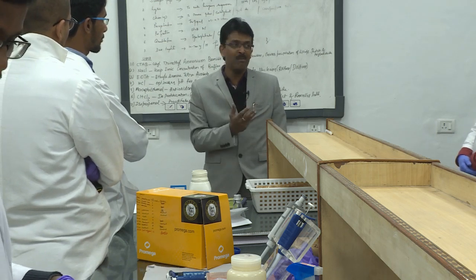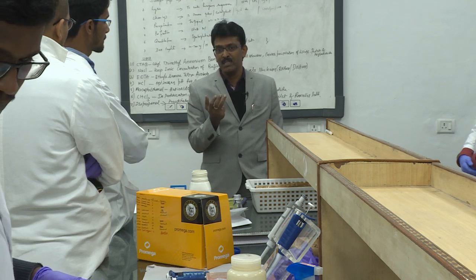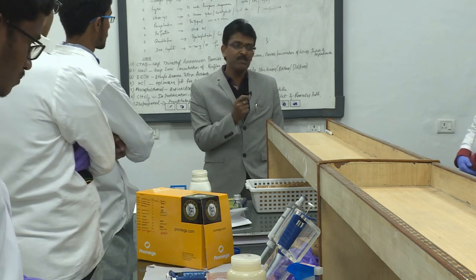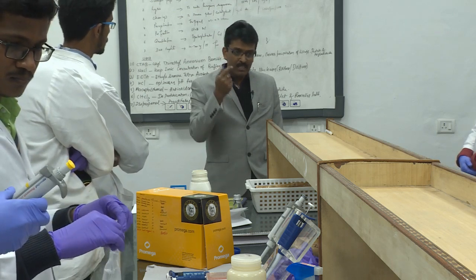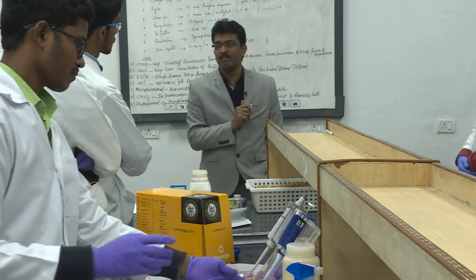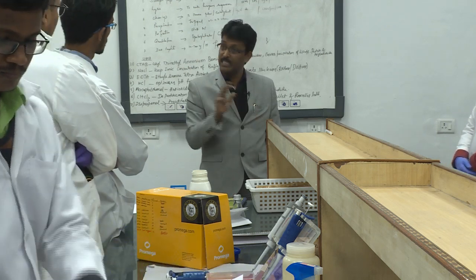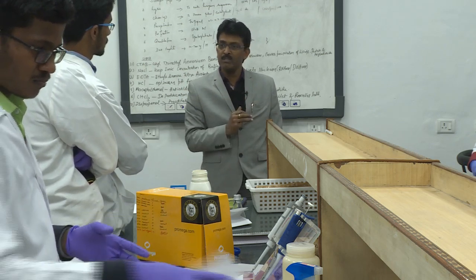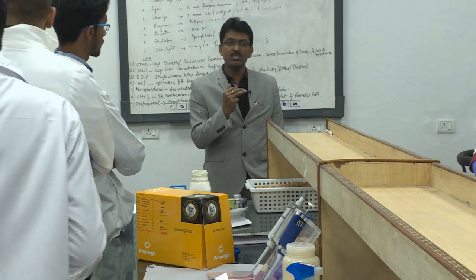So, unless you have the biological backup of your data, it is still not really useful in the long run, right. That is what most of the laboratories do, whatever sequence data they generate, from where they are generating the sequence data, the biological material is preserved. So, normally what we do, once the organism is isolated, you confirm its identity tentatively and you find this is the one you wanted to isolate. Having isolated it, now the next step is you have to preserve it, right. When the preservation stage comes, now the question is how to preserve it.